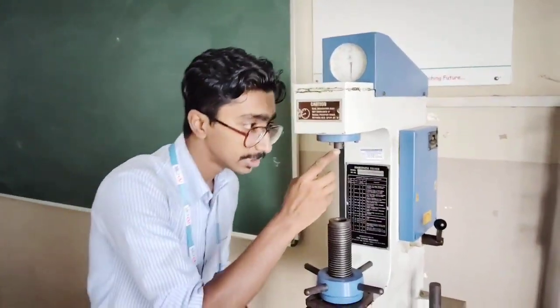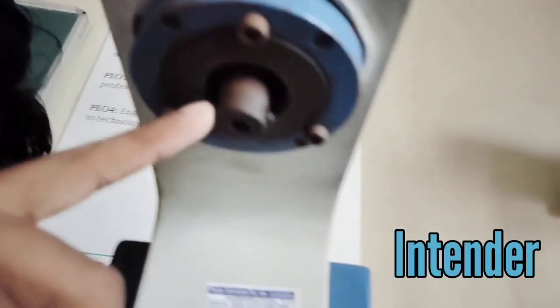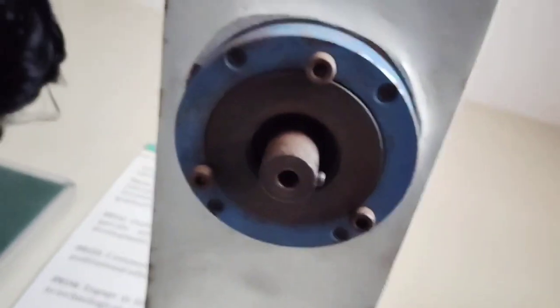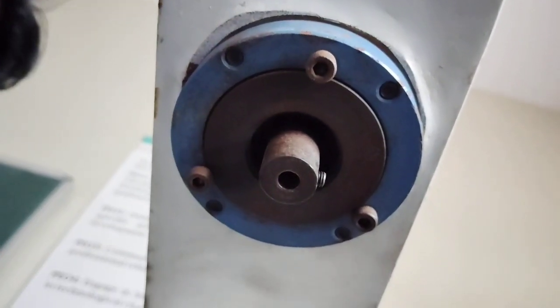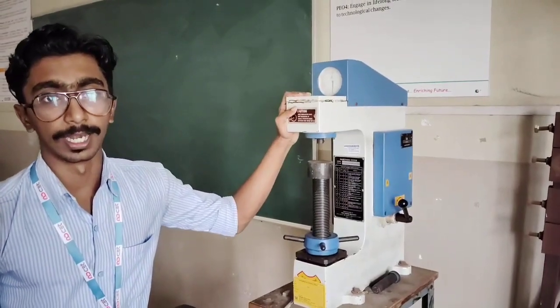So next is the mounting of the indenter. We can mount our indenter from this part, and with the help of an Allen key, we will tighten the indenter. Now we will understand the experimental procedure of this Rockwell hardness test.